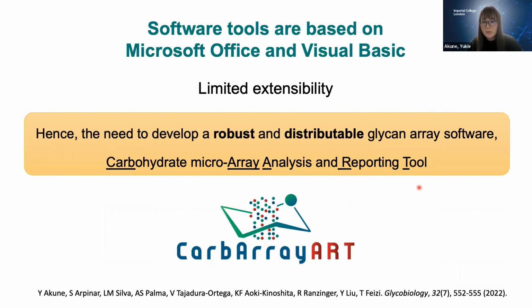However, the Mark Stoll software is very powerful, very useful software, but it has been developed in stages using Microsoft Office and Visual Basic, and they were not readily distributable, and there was some limitation on its extensibility. So we developed robust and distributable glycan microarray software, CarbArrayART.